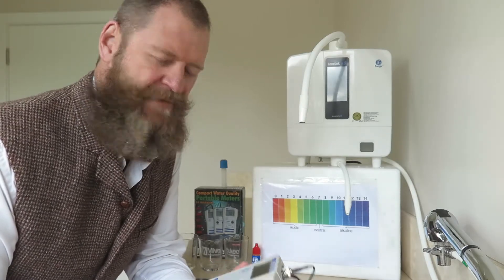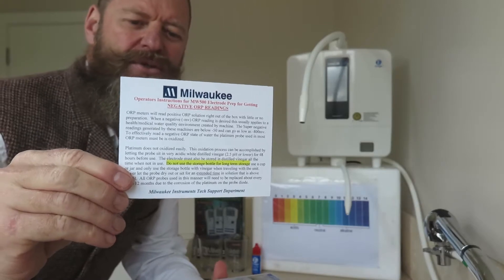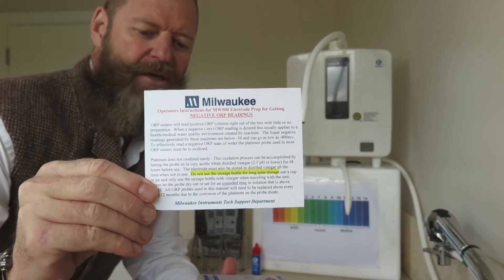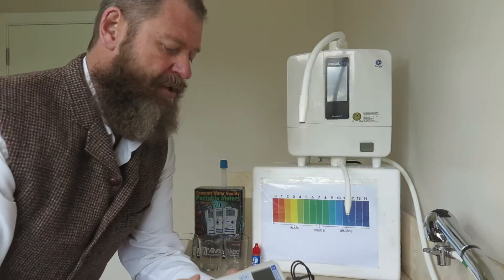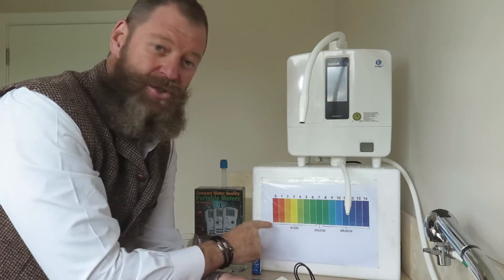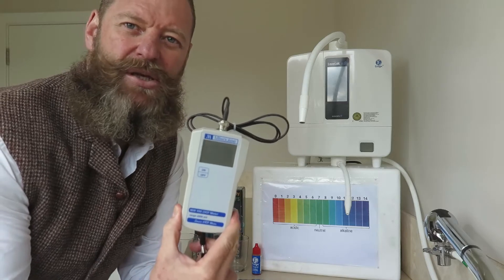Hi there everyone. Today we're going to be talking about the Milwaukee 500 oxidation reduction potential meter and how to calibrate it. The box comes with a set of instructions that are explicit about soaking it in vinegar for 48 hours if you're going to be using a negative oxidation reduction potential, or ORP. I'm going to be using all the functions that give me alkalized water as well as strong acidic water — in my personal opinion this is the only machine that actually does a good job.